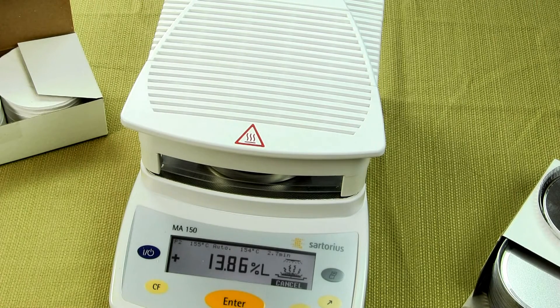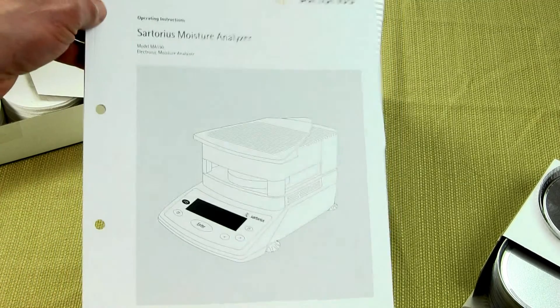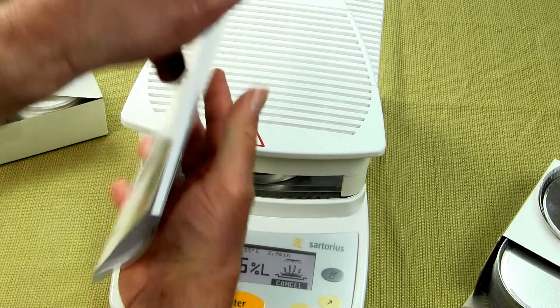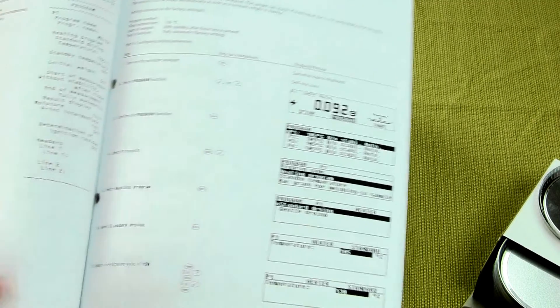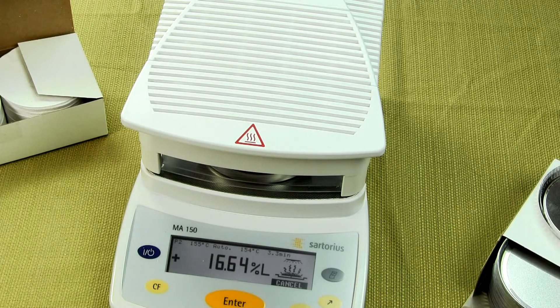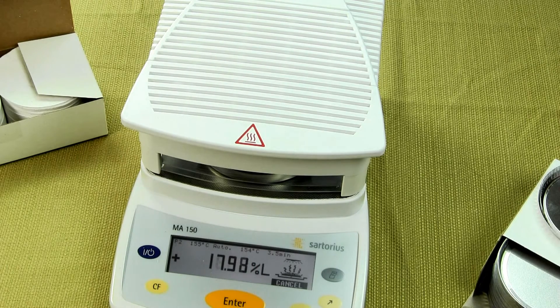I want to cover a few more things the moisture balance comes with. It comes with a great manual — Sartorius does a super job with all their documentation. When you purchase the MA-150 Moisture Balance, you get a great manual with step-by-step instructions on how to set up your moisture balance and run the test. Many moisture balances on the market today are coming from China and the manuals are horrible. If you're looking for a quality moisture analyzer, you're going to pay more, but you're going to get a well-engineered, well-documented product.